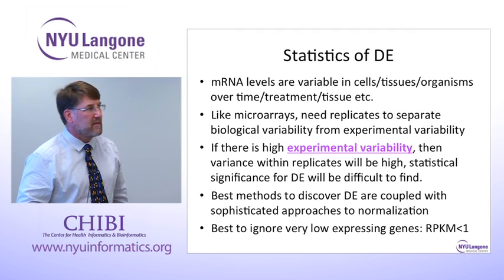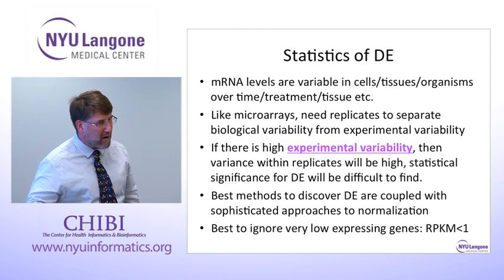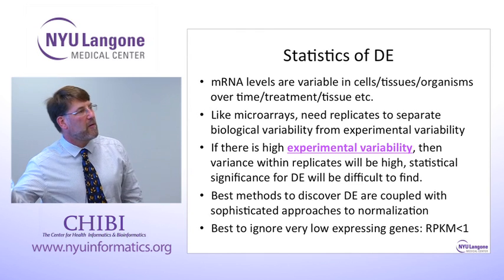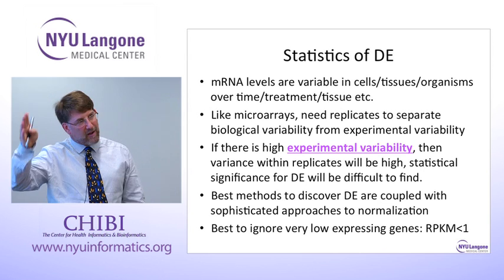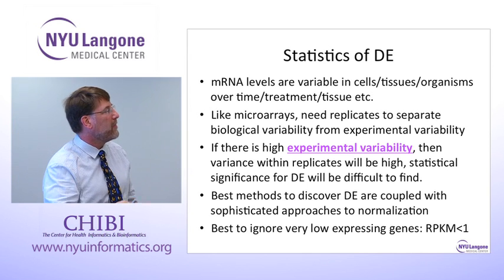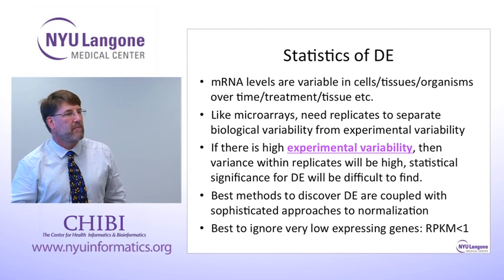Unfortunately, RNA-seq samples cost money. And in order to get an adequate number of replicates, in order to have statistical power to measure the variability and set your error bars appropriately, you have to do more replicates. This is where we go back to my earlier slide where we showed the cost of sequencing going down and the number of sequences that you need in order to find a detectable level for your message is finite. You don't have to sequence infinitely deep in order to get reasonable data on most of the messages.